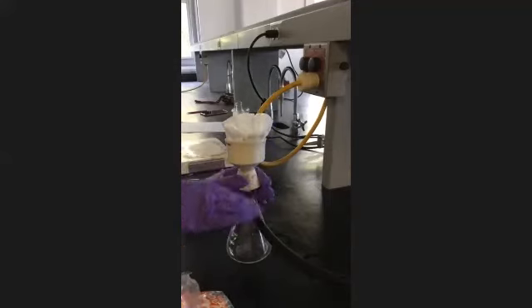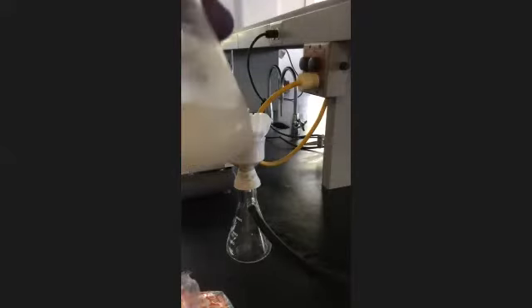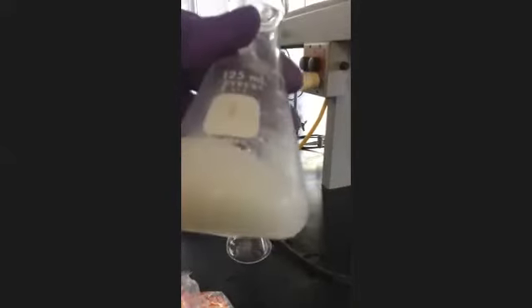Thank you. So you can take the aspirin out of the ice bath and swirl it around a little bit to get it off the sides and all that stuff. And let me see it before you filter. So this is what you want right here. You want your aspirin to be a white crystalline solid, right?